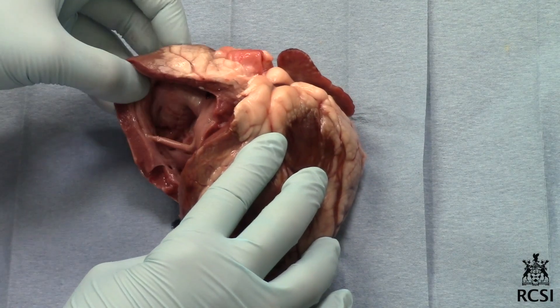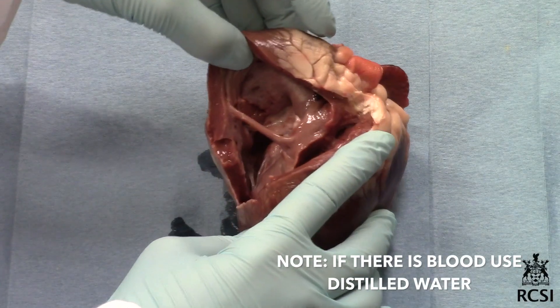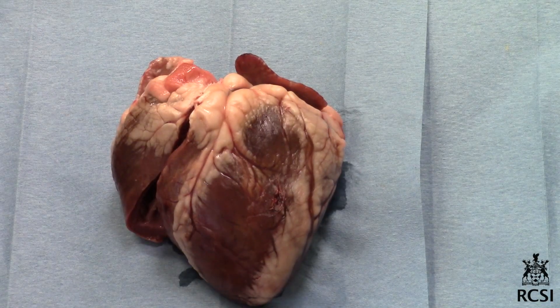Lift up the triangular wedge of muscle. Very carefully clear any clotted blood from the chambers of the heart and the roots of the blood vessels. Take great care not to damage the valves and the chordae tendineae.